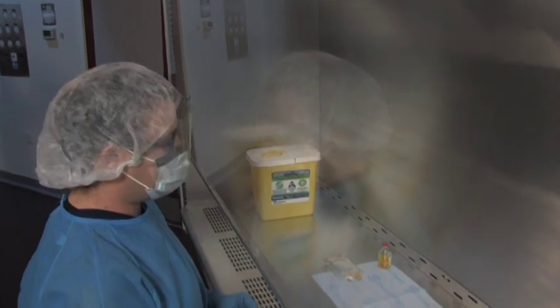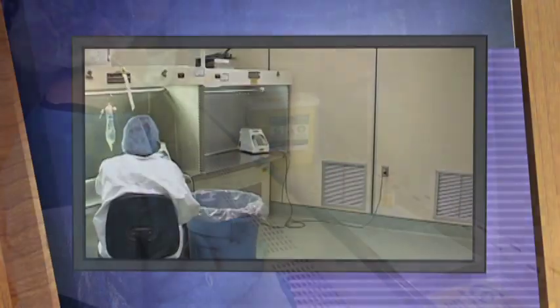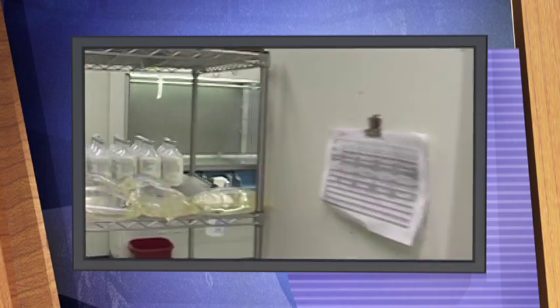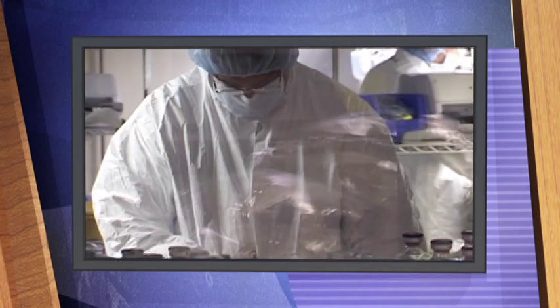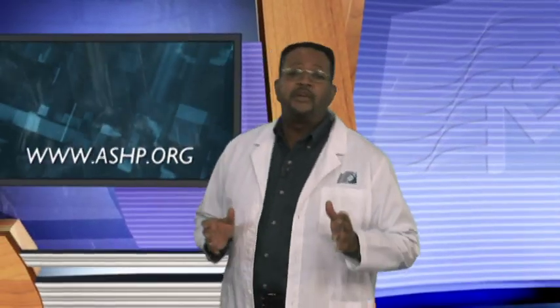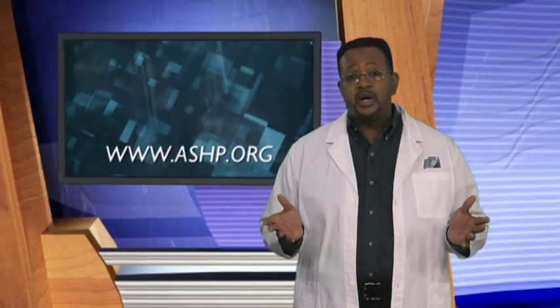Inside a facility, the space set aside to perform aseptic compounding is called a clean room or buffer area. This area should be away from the flow of traffic, and only specially trained personnel are permitted entry into this workspace. The humidity, temperature, air quality, and cleanliness of this environment is controlled through an air filtering system and employee work practices. This is meant to reduce the risk of environmental contamination to the compounded sterile preparations. ASHP endorses compliance with USP Chapter 797 and provides educational and training materials to support technicians responsible for compounding sterile preparations.